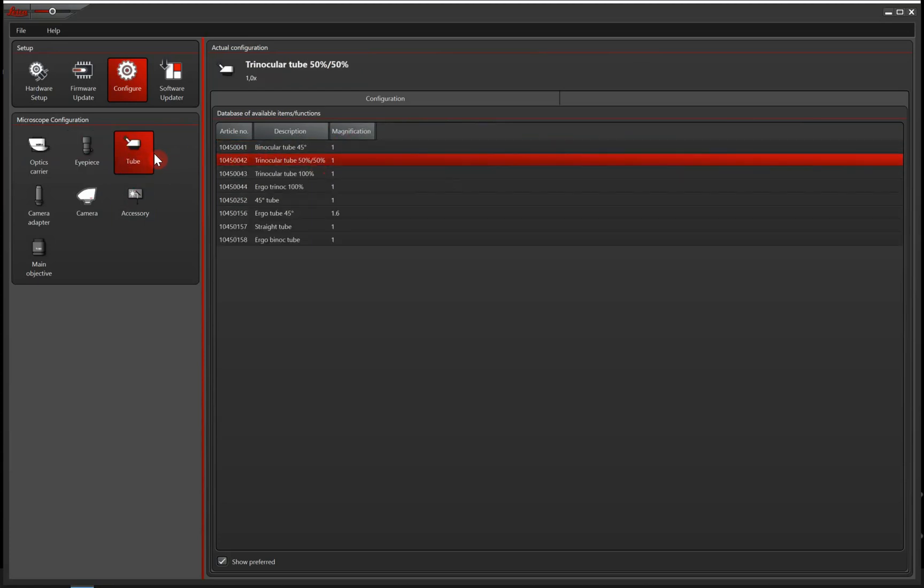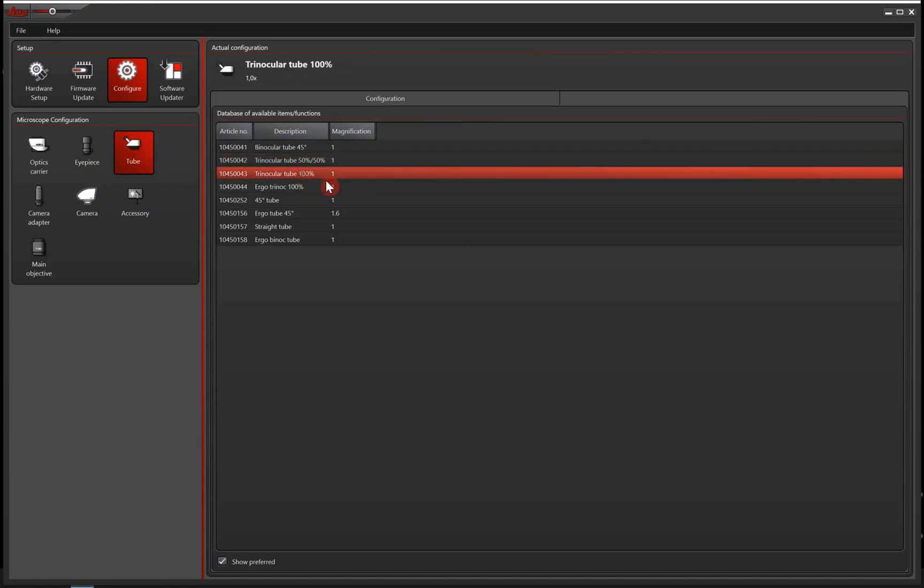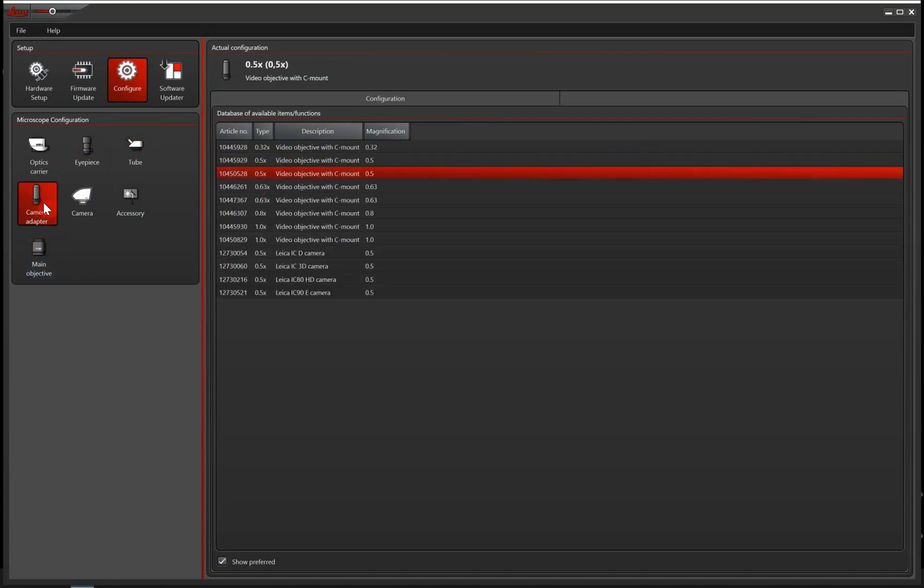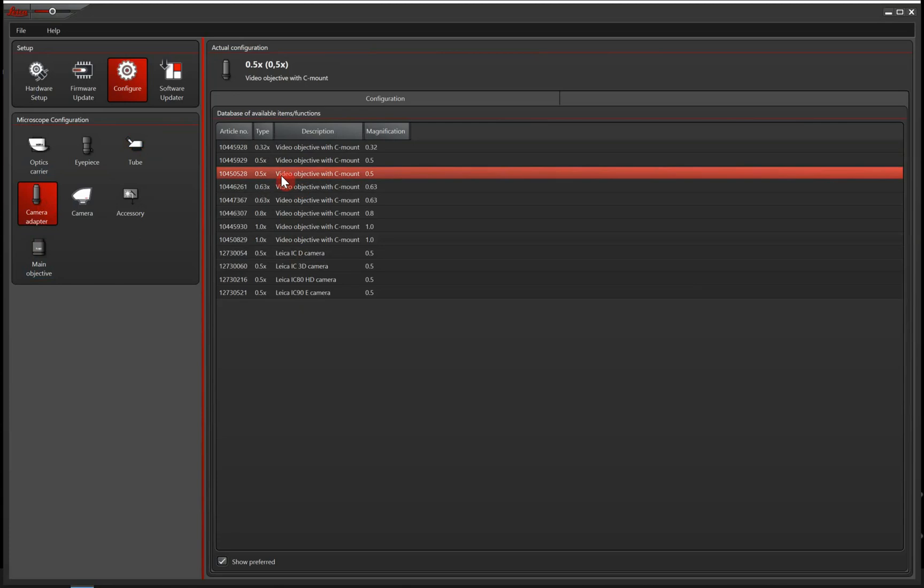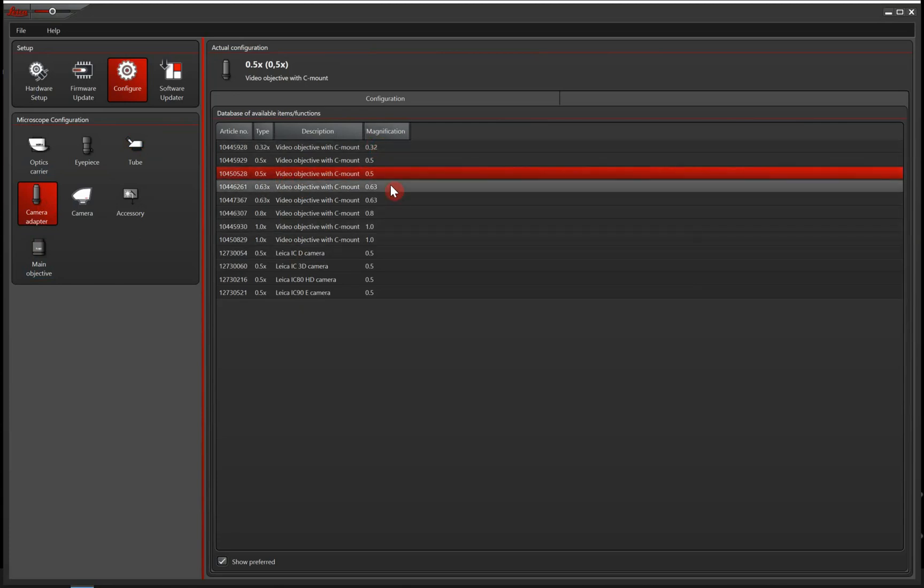And then we go ahead to the tube, and we can just say we have a trinocular tube like this. And then the camera adapter. You can choose the one you have on your microscope. Again, important that you get the magnification power correct here.